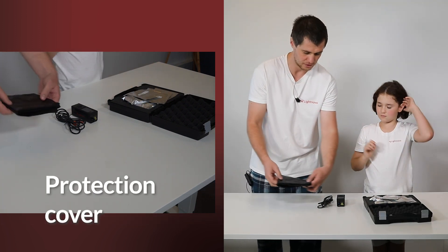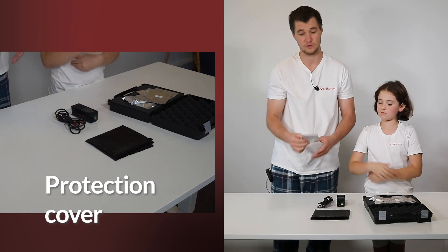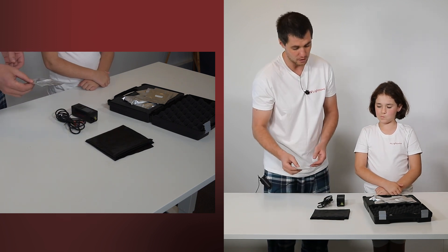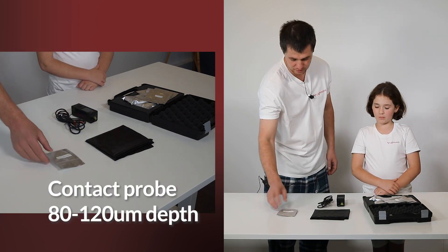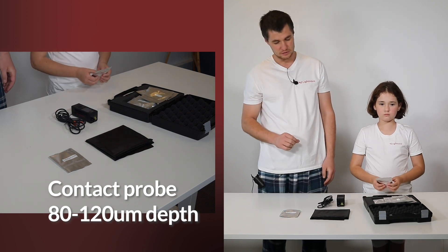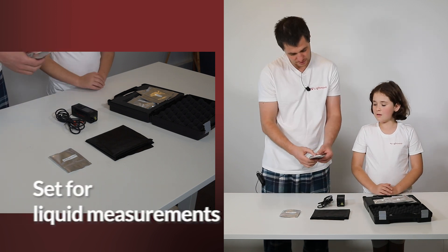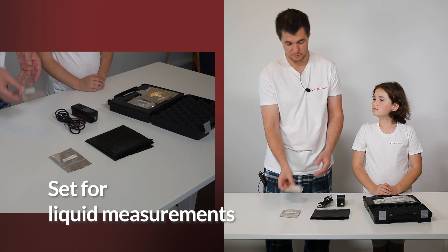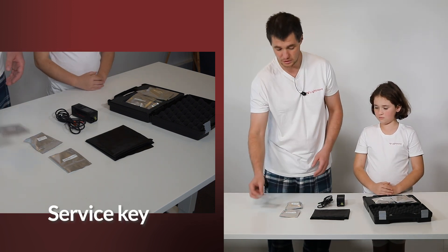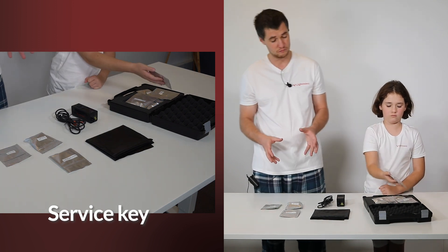First, it is a protection cover for the light. If you do measurements and you want to avoid contamination from the outside environment, then we have several Raman probes. This is a contact probe with 80 to 120 microns penetration depth. This is a set for liquid measurements. Service key if you would like to open Miniraman and do some service procedures.